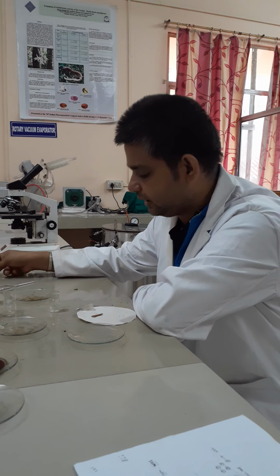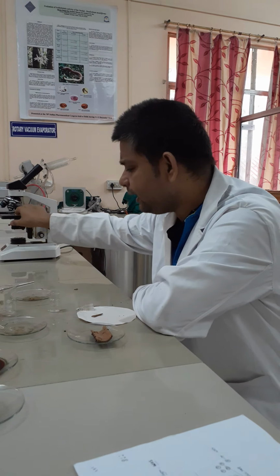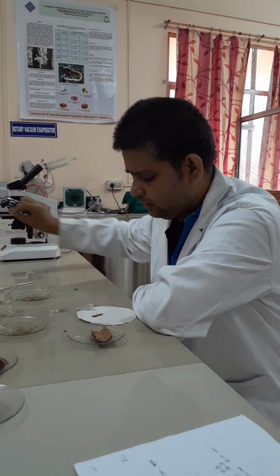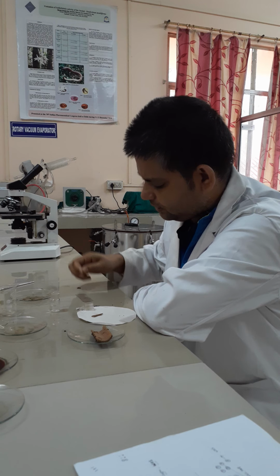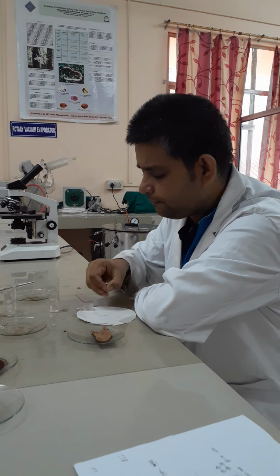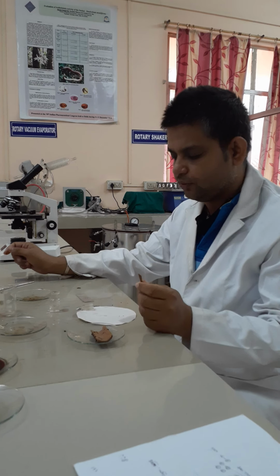Now, for convenience, I have already collected the boiled piece of Cinchona, which we have boiled previously. So this is a very small piece of Cinchona bark.